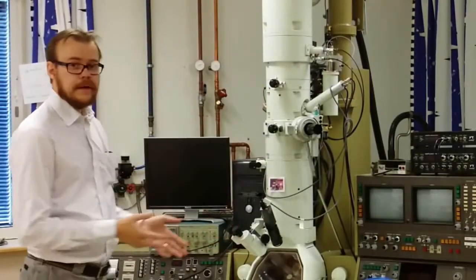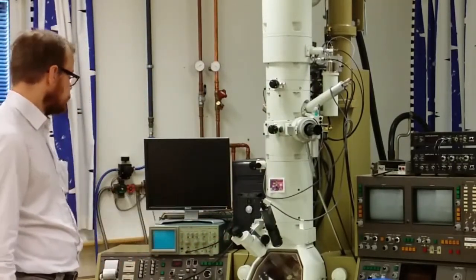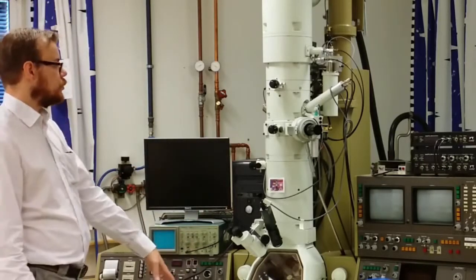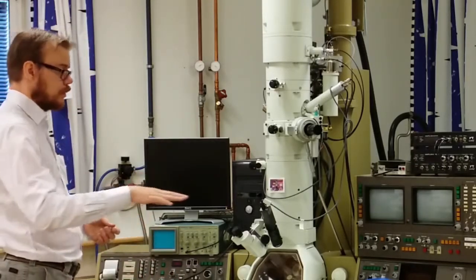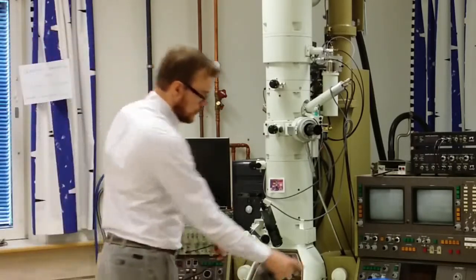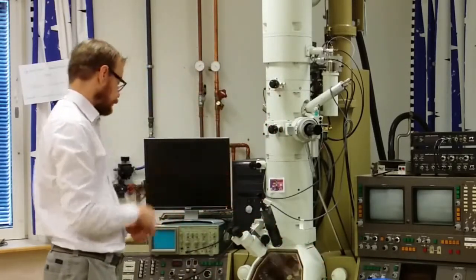As you can see, the microscope contains a lot of different knobs and control panels. On the bottom you also have pedals. The pedals you use to tilt the sample in different directions. To position the sample across and change the view of the sample that you are viewing, you use these two knobs. These you can turn and then the sample will move.